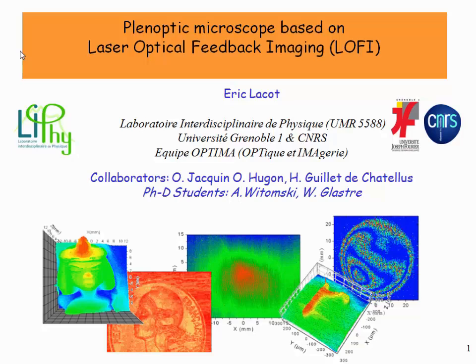Everybody. In fact, the aim of this talk is to show you how we can combine the high sensitivity and also simplicity of the laser optical feedback imaging with the high resolution of the synthetic aperture imaging to finally obtain a plenoptic microscope, which allows the imaging through heterogeneous and turbid medium. And this work is carried out in the laboratory for interdisciplinary physics of the Université of Grenoble in France.